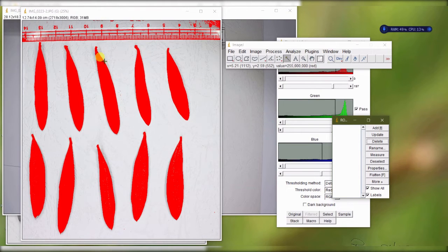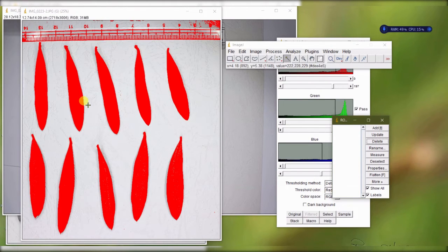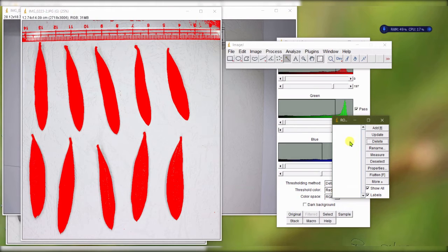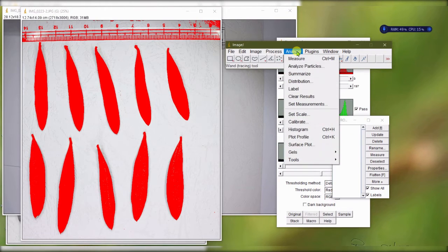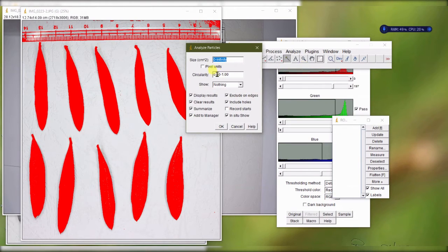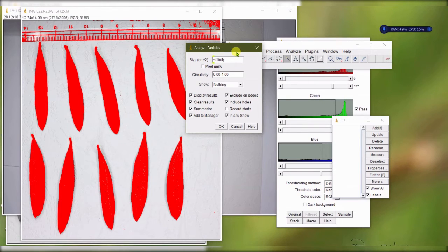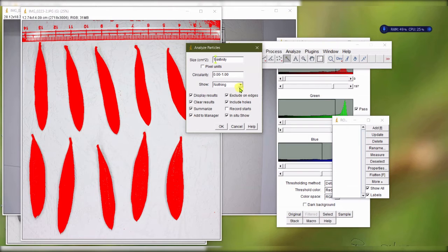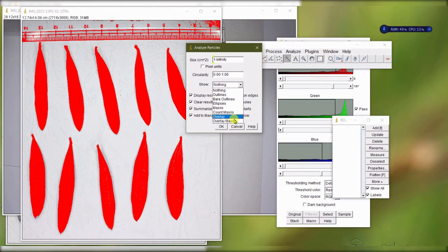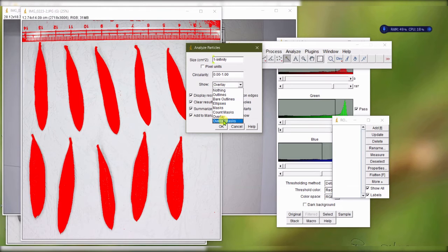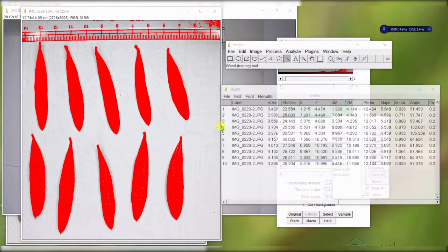Another thing you could do - you can automate this whole process for the whole set, not only one by one like we did now. You can do it by analyze particles. You set the minimum - for example, the minimum is, I already know all of them are more than one square centimeter. So I will just do that there. Then I overlay mask so it will show me the numbers. Then I can click OK.